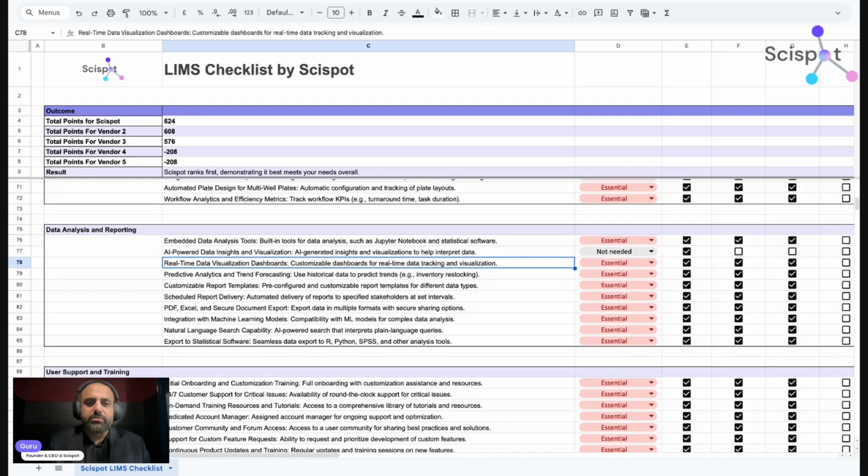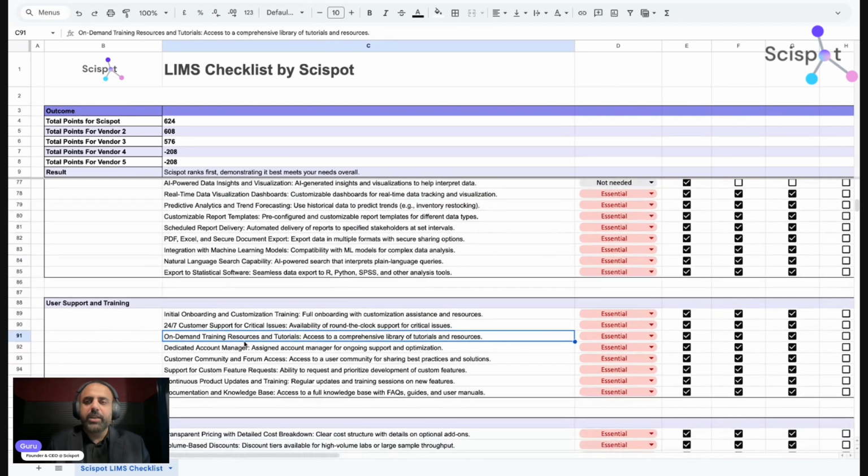User training and support. Even if the system is very out of the box, you always need guidance. So if you get white glove support, that would be amazing. I would consider evaluating LIMS based on that. And your time zone, where the vendor is located, if they have support, what their response time is, and if they will help with initial setup.